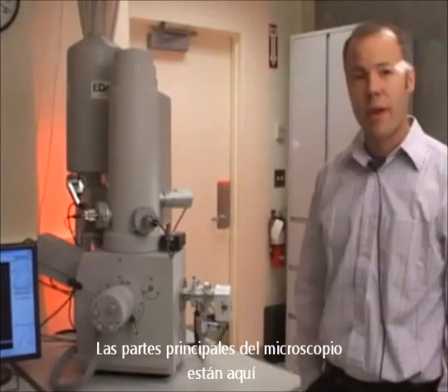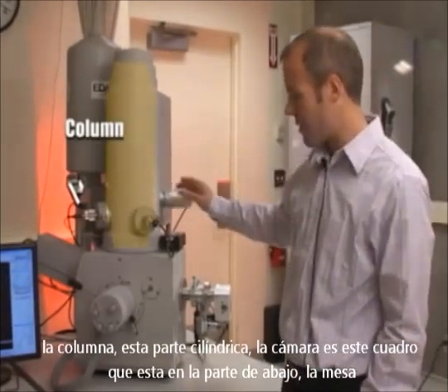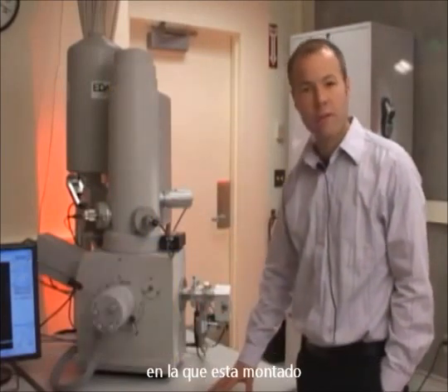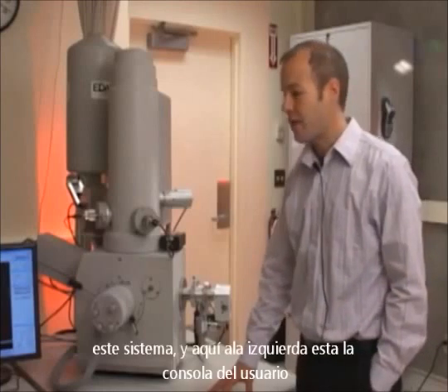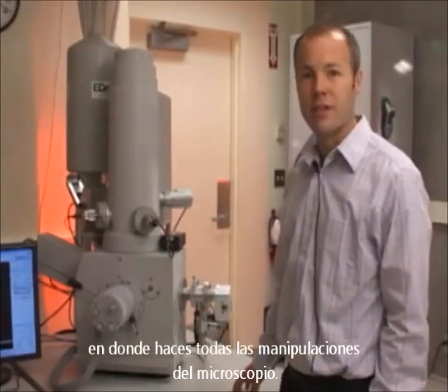The main parts of the microscope that you see here are the column — it's a cylindrical piece. The chamber is the square at the bottom. The table that the system is mounted on. And to your left here is the user console where you do all the microscope manipulations.